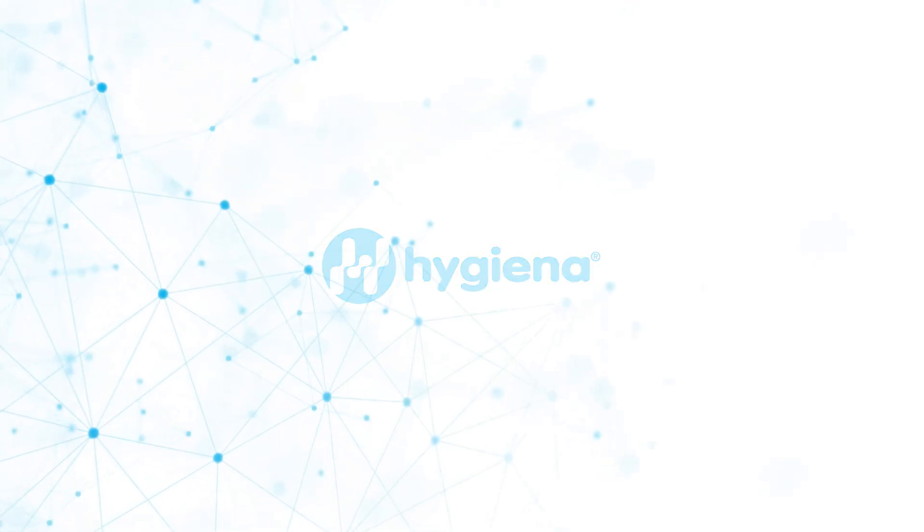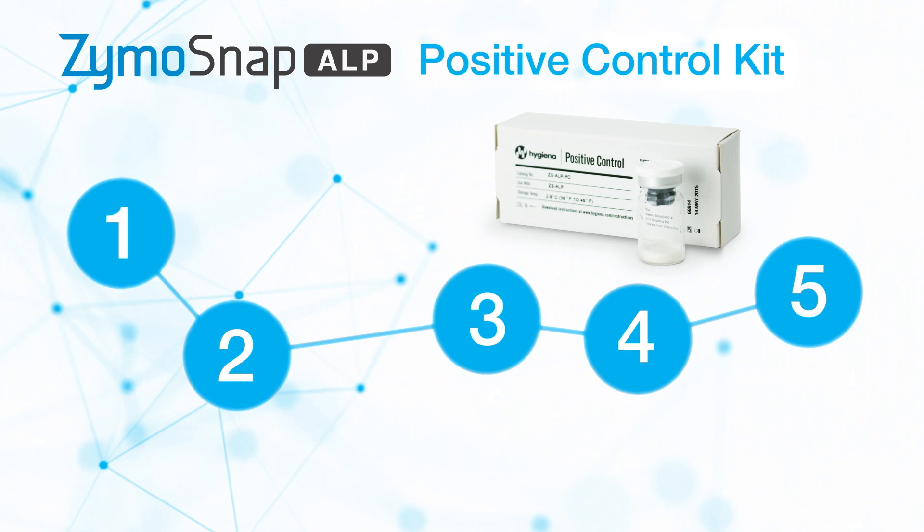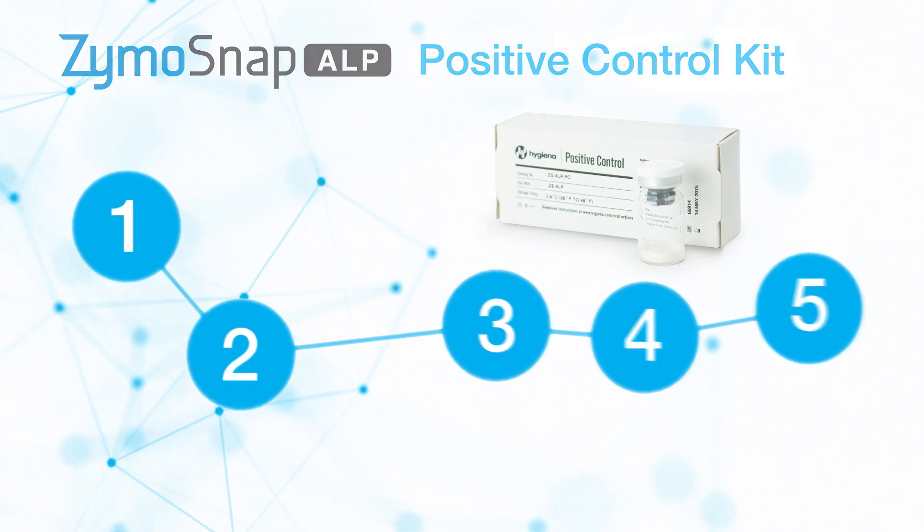Welcome. Before using the ZymoSnap ALP test device, the ZymoSnap ALP positive control kit must be run to establish pass and fail limits for each specific product type.